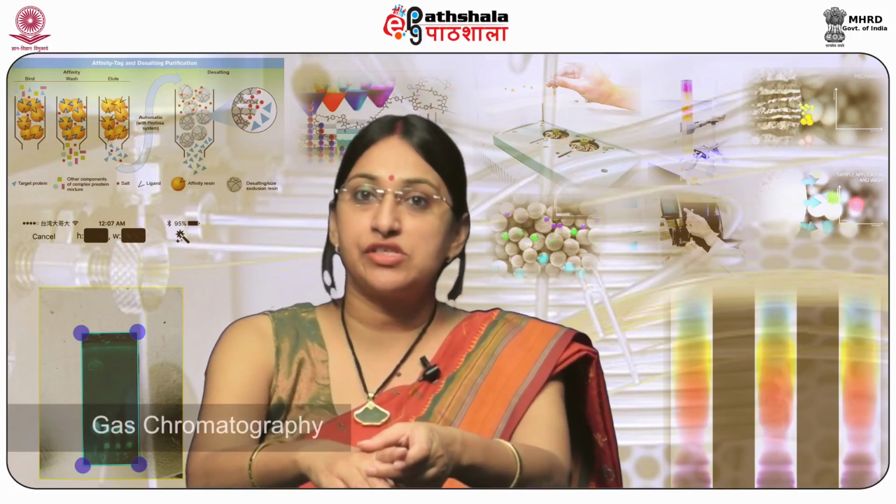Good resolution thus can be obtained by increasing N by lengthening the column, which leads to an increase in retention time and decreasing the band broadening. Secondly, by reducing the height equivalent to a theoretical plate by reducing the size of the stationary phase particles. Thirdly, by controlling the capacity factor K, separations can be highly improved. Then changing the temperature in gas chromatography can also give us good resolution, and changing the composition of the mobile phase in liquid chromatography can help to achieve good resolution.